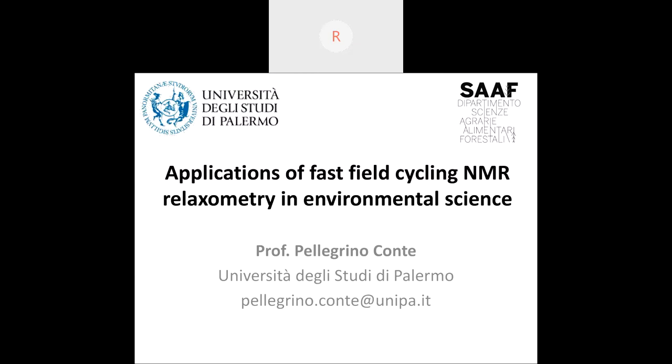So, as Danuta said, my presentation today concerns the applications of fast field cycling NMR relaxometry in environmental science. This is quite a very interesting argument, not because I'm doing this for my research, but because we need in environmental science tools to understand environmental quality that is related to soil quality, water quality, air quality, sediment quality.